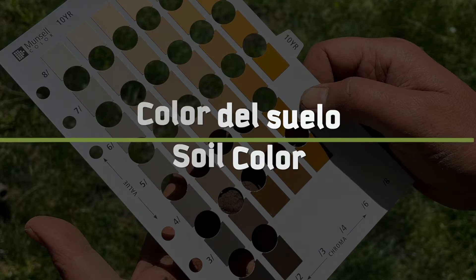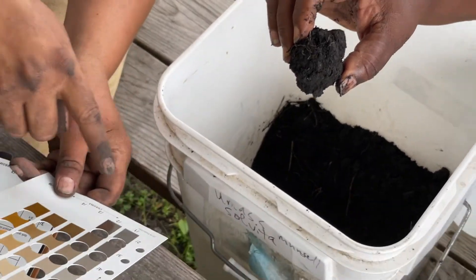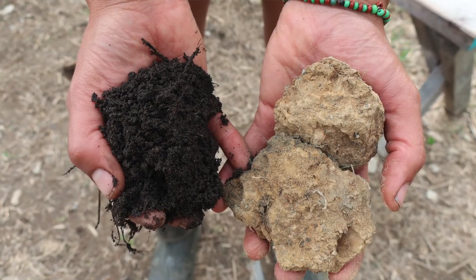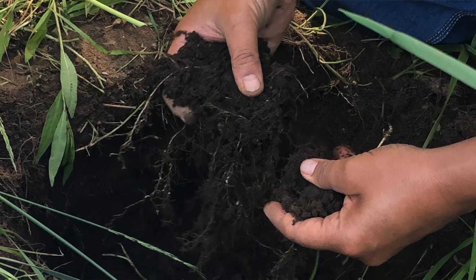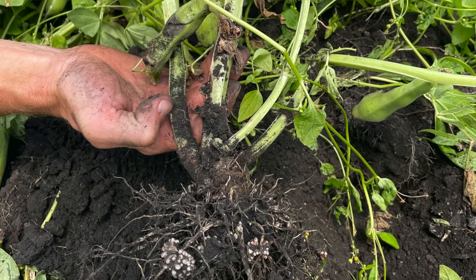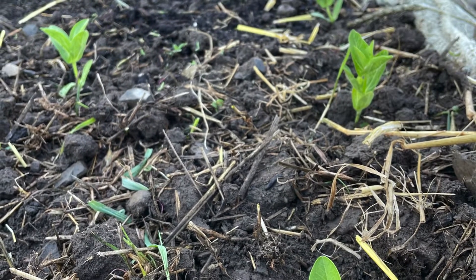In this test, we use color as an indicator for organic matter. Organic matter is the portion of the soil that comes from living matter, including plants and small organisms that are alive or decomposing, and black humus, which is the decomposed material. Organic matter is where we find soil carbon. Dark organic matter enters the soil from the surface and becomes part of the soil layers below, bringing nutrients and dark color pigments with it. Most organic matter is found within the top eight or so inches, and this is the depth from which we'll take our samples.